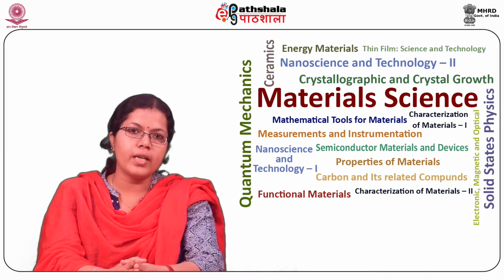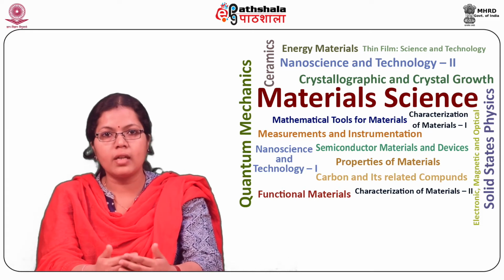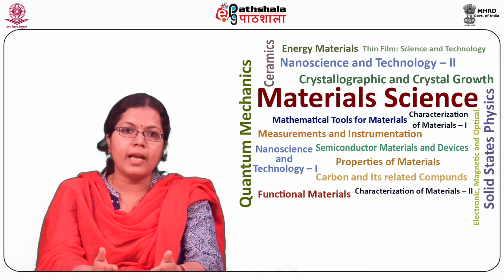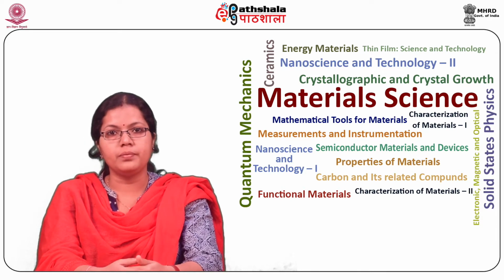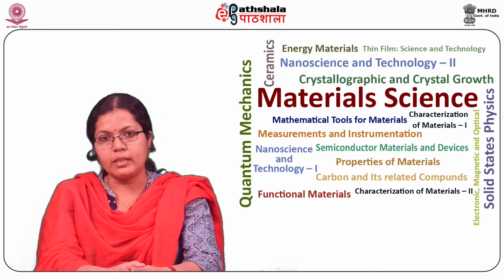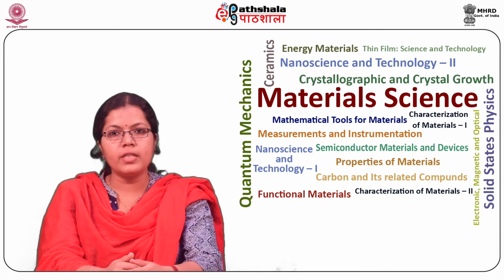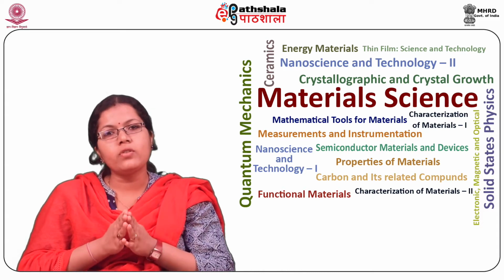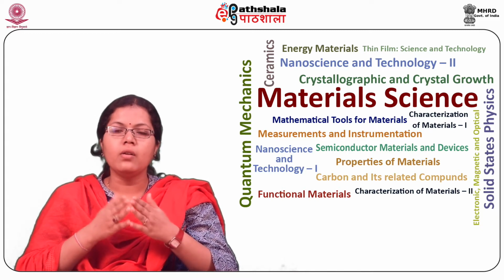In the Vogel configuration, a short LaB6 rod is heated directly by transient current, perpendicular to the length of the rod, using firm electrical connectors that also provide support for the rod. Pyrolytic graphite is used in between the conductors and the rod to avoid the difficulties of chemical reactivity of LaB6 and the conductors.